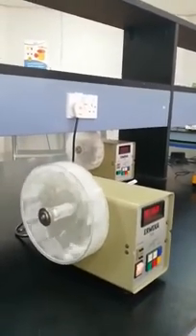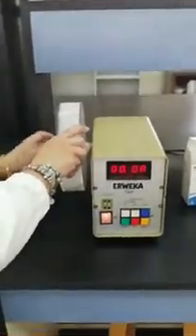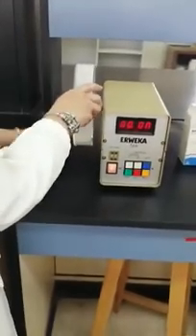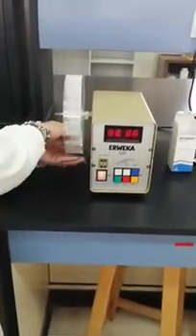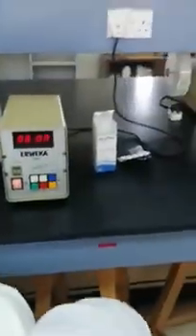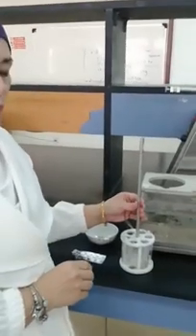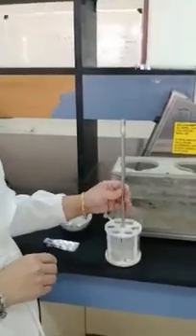After the 4 minutes are completely finished, we stop the device, open the friabilator, and take the 11 tablets, brush them to get rid of the dust, and we weigh them again. That enables us to calculate the percentage loss.